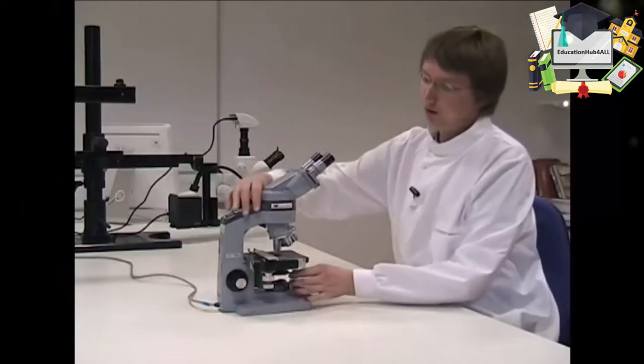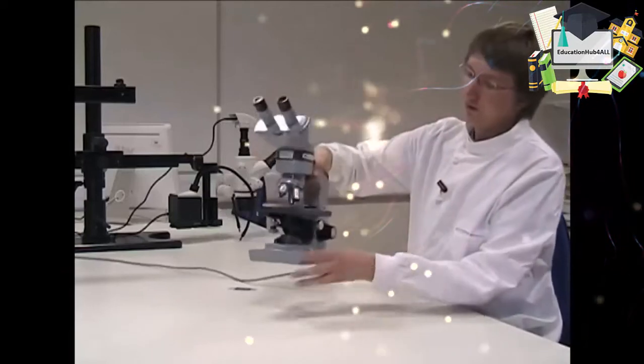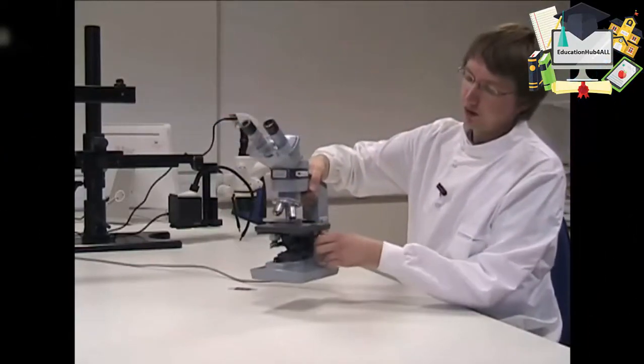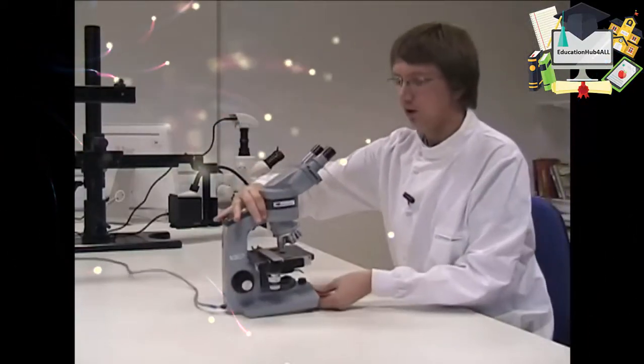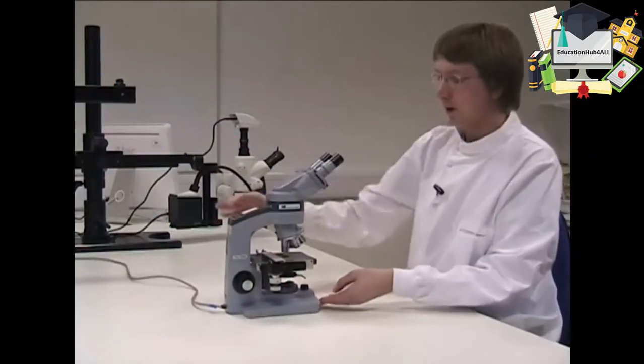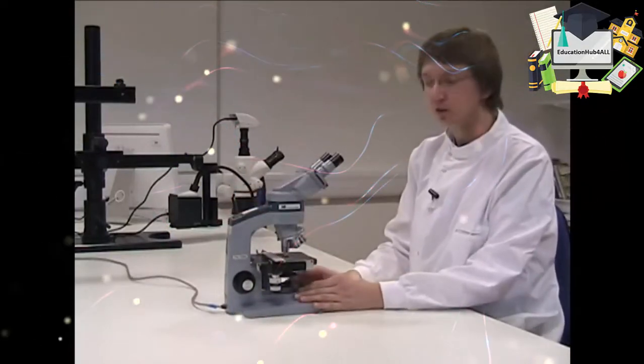Underneath the stage is a condenser system which is adjusted height-wise here. That focuses the light on your slide from below and at the very base is an in-base illumination system.